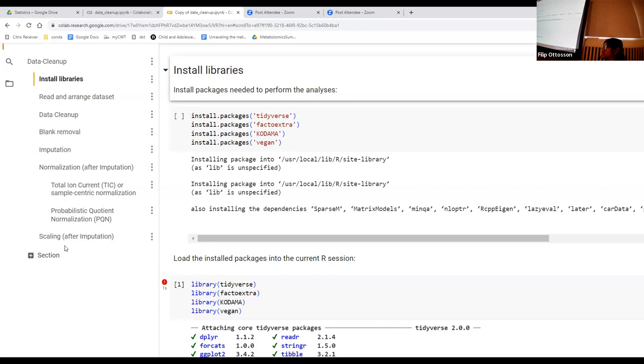It's based on the intensity. We just compare if a particular feature's intensity is, for example, 10, and it's also 10 in the blank, then probably it's from the blank, so you might remove that feature. This is where the threshold plays a role. You just set the threshold. So you're not entirely removing all the features that are present in the blank.